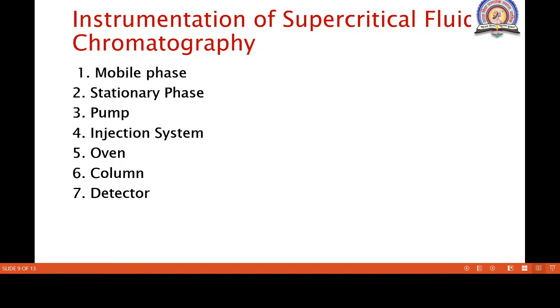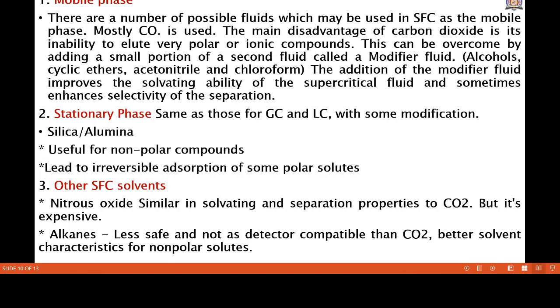Okay, so these are the terminology used in the SFC. Then we see the instrumentation of this supercritical fluid chromatography. In that, the instruments used are mobile phase, stationary phase, pump, injection system, oven, column and detector. Here the flame ionization detectors are used. Okay, so these are the instrumentation for the SFC. We only list the instrument names here.